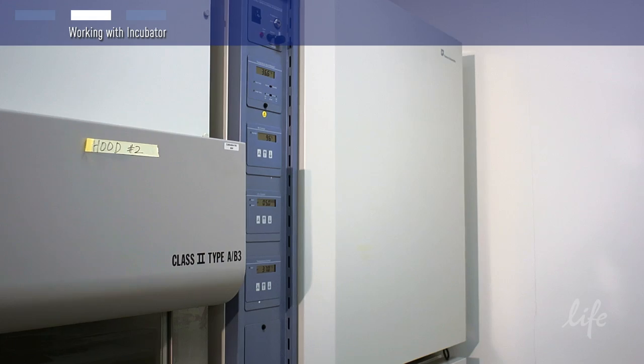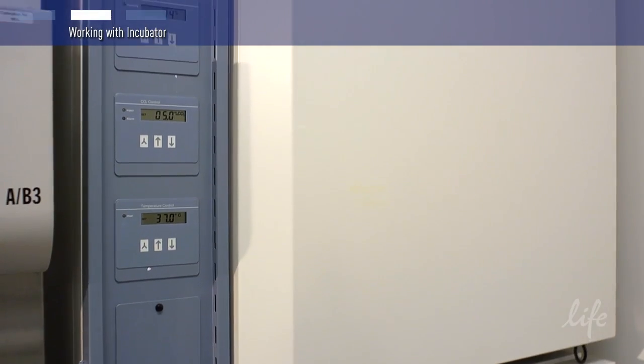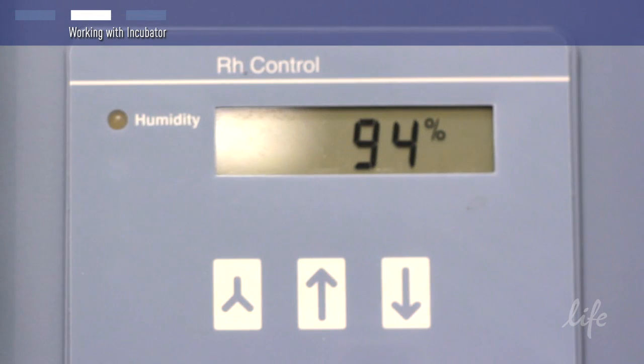You will also need a cell culture incubator. Most mammalian cells grow well at a pH around 7.2 to 7.4 and a temperature of 37 degrees Celsius. The carbon dioxide range is 5% to 10%; we recommend 8%. Unlike bacteria or insect cells, mammalian cells require a high humidity CO2 incubator to control evaporation and maintain culture pH.